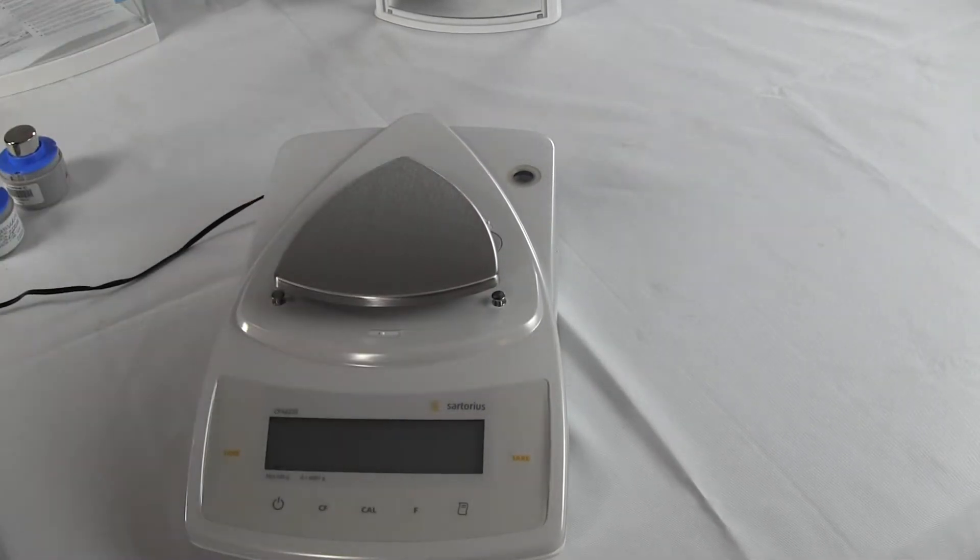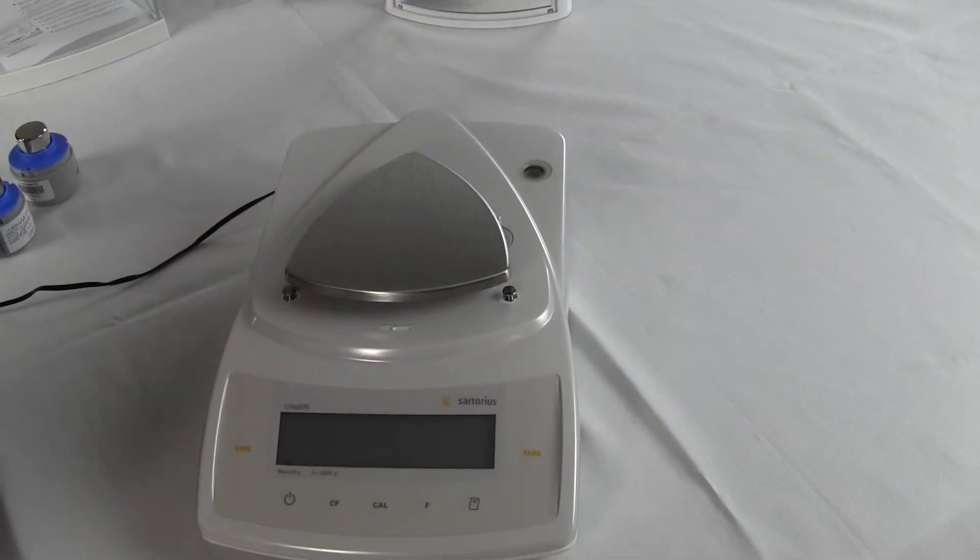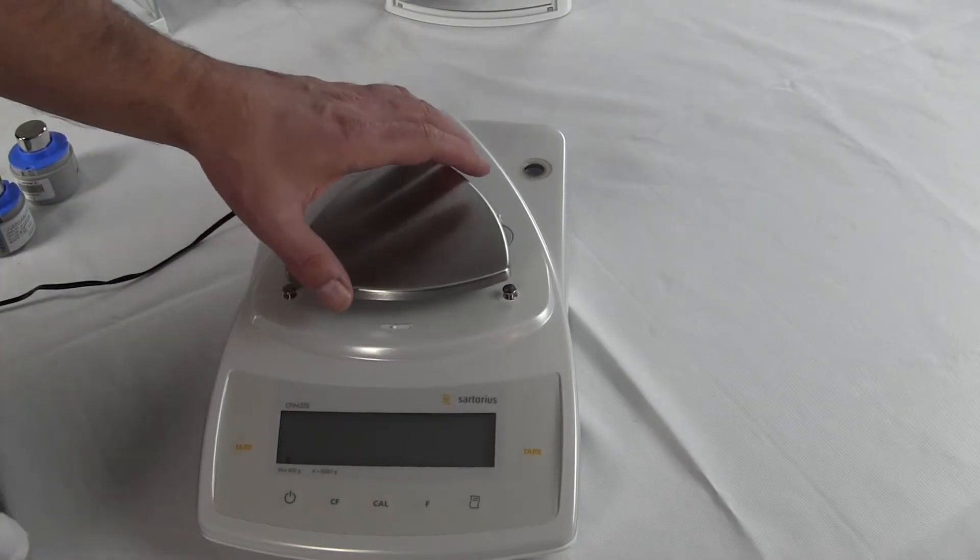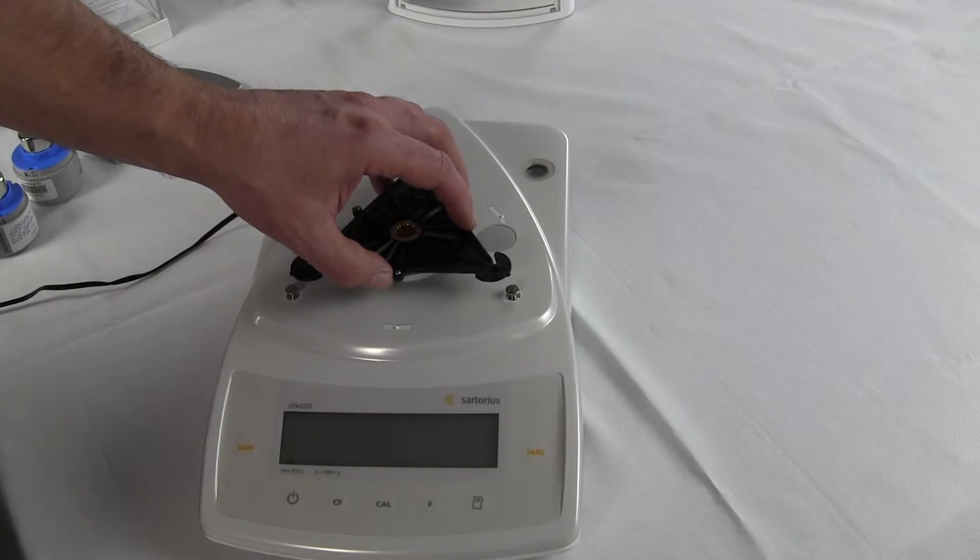If you were actually with a silicon wafer, you had an 8-inch wafer, you could put that wafer right on the balance, no problem. Sartorius, one of the great features they have is that removable glass draft shield.